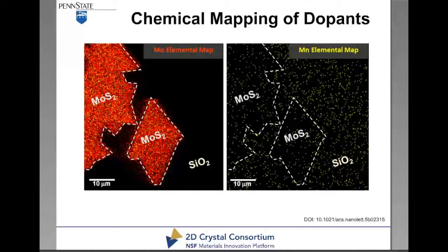The question is, for the STS measurements, are there any special things that we do to protect the surface for the actual measurements themselves? We did not do anything particularly special to prep the samples, other than seal them in a nitrogen environment prior to introduction into the STM-STS system.